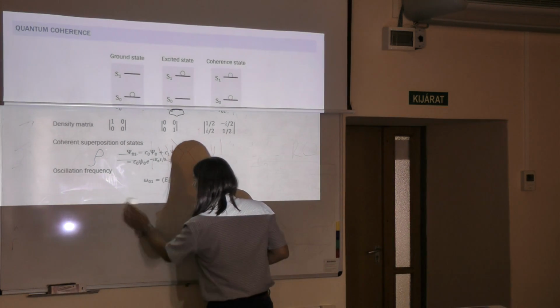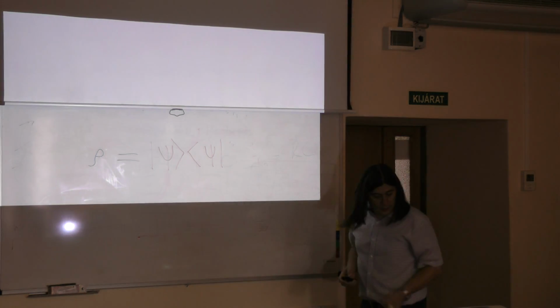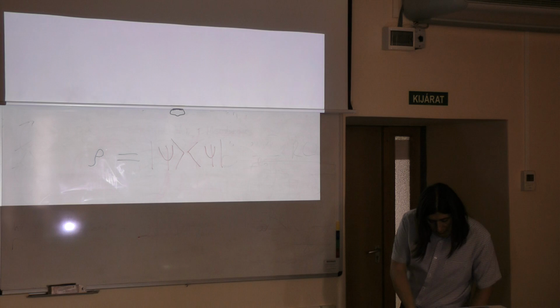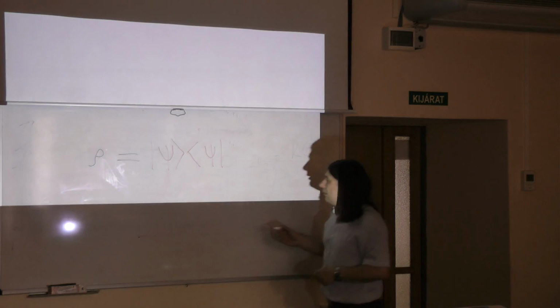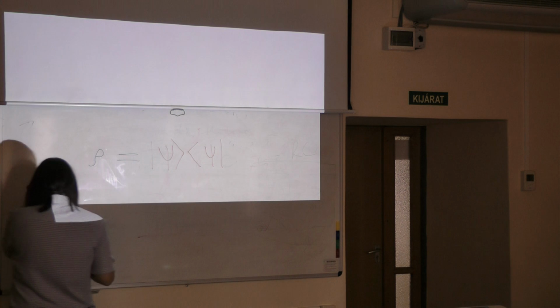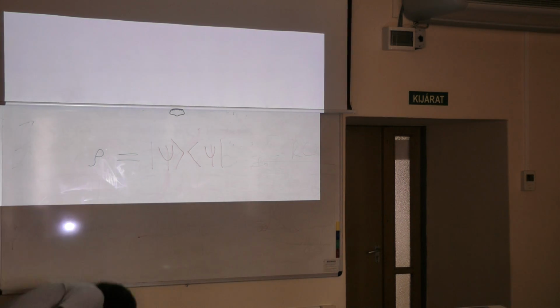What is also very useful to know is that when we measure electromagnetic radiation from the sample, basically what we measure is polarization.